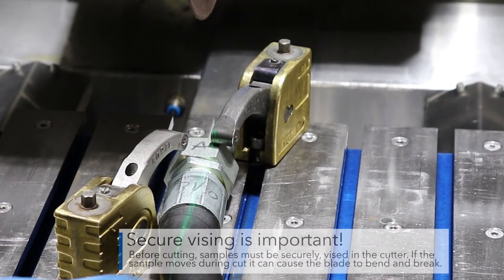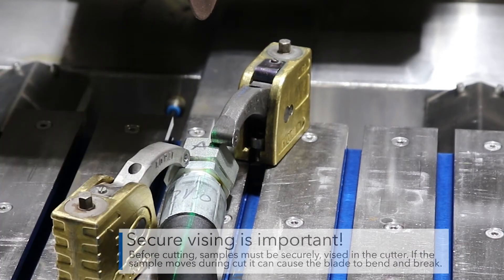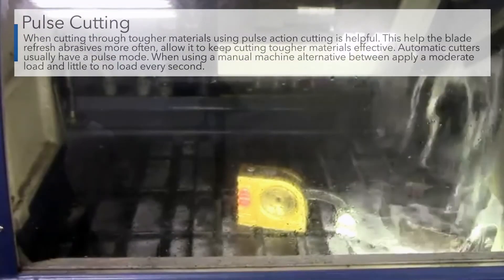Before cutting, samples must be securely fixed in the cutter. If the sample moves during the cut, this can cause the blade to bend and break. When the proper blade is selected, in most cases cutting through the sample should require little load on the handle for manual machines, or low motor current for automatic machines.